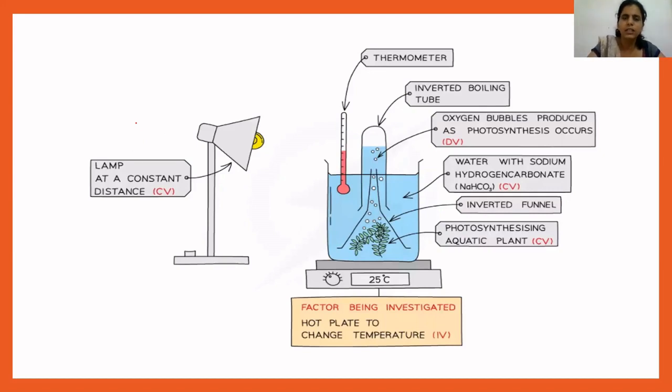Like it's shown here in this picture. Okay. So you require a beaker. First, you have to take a beaker and fill water in it. Fine. And then you have to take any aquatic plant. Now, this aquatic plant could be hydrilla, or it could be Canadian pondweed or Elodea, anything. You have to take all these aquatic plants together and insert them in the stem of the funnel. Okay, so this is called the stem of the funnel. You have to insert all the cut ends of the plant into the stem of the funnel.